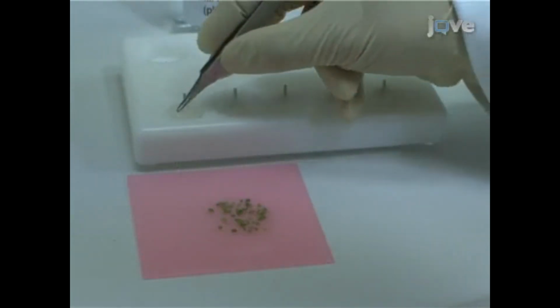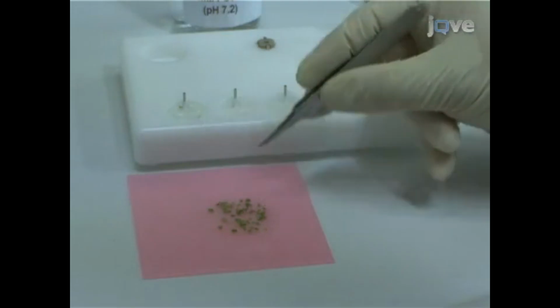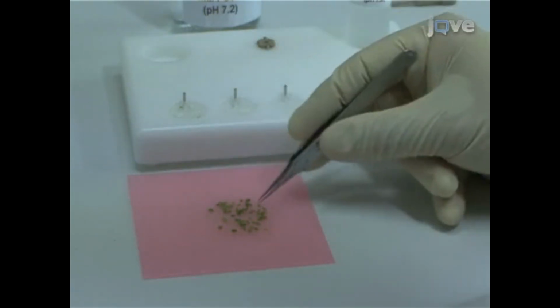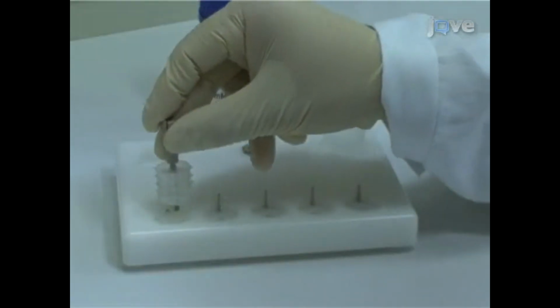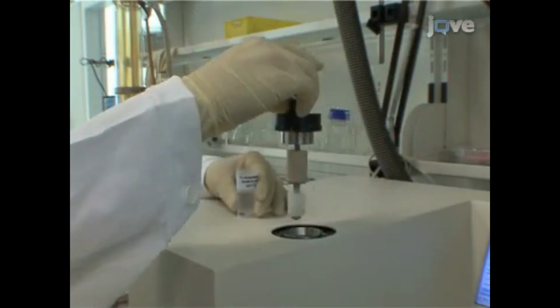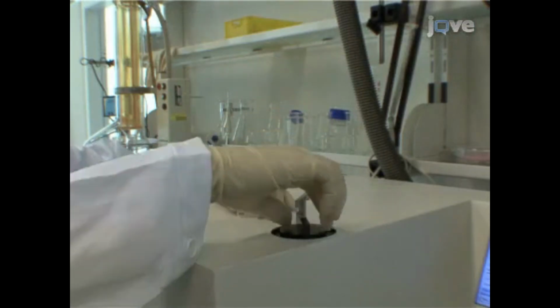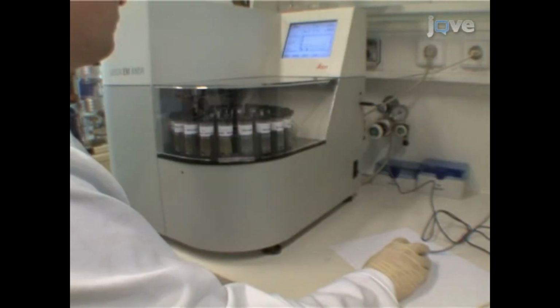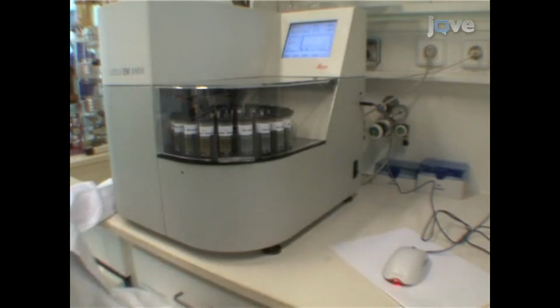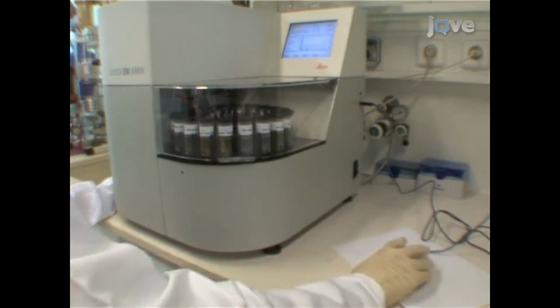Using fine tweezers, transfer the sections immediately into the designated baskets with a mesh width of approximately 200 micrometers. Stack the baskets on top of each other and insert them into the monomode chamber. Start the previously programmed microwave-assisted sample preparation protocol for fixation, dehydration, and infiltration.